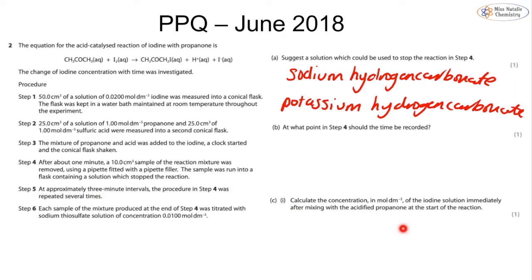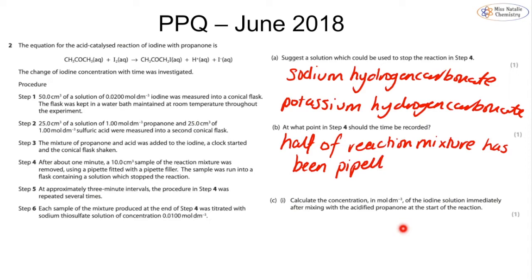And part B, at what point in step 4 should the time be recorded? Well, we mentioned that before. That is when half of our reaction mixture has been pipetted into the quenching solution.